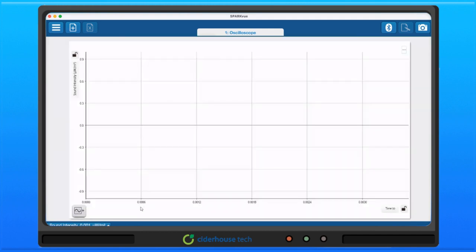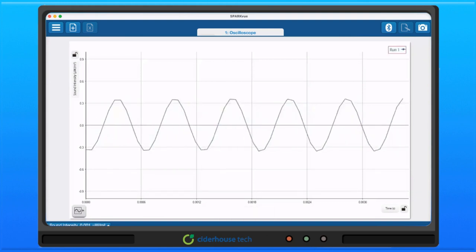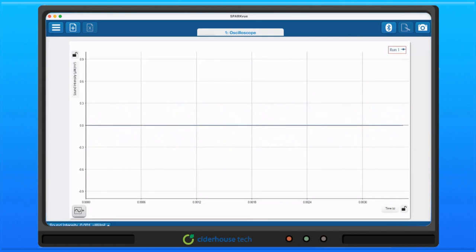Next, I'm going to get ready to select data. I'm going to turn off my sound so you don't have to listen to me whistle. As you can see, the trace was hard to follow. So what we're going to do now is set a trigger. I can do that by selecting the icon at the lower left-hand side and selecting the arrow pointing up to the line.